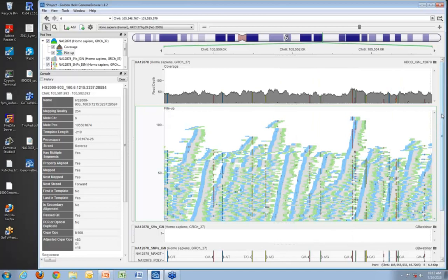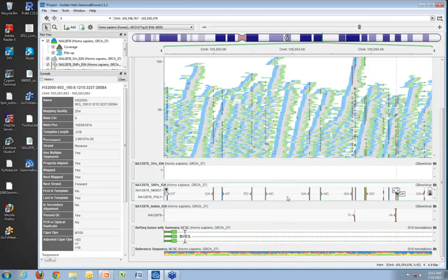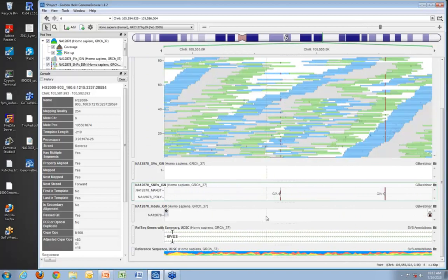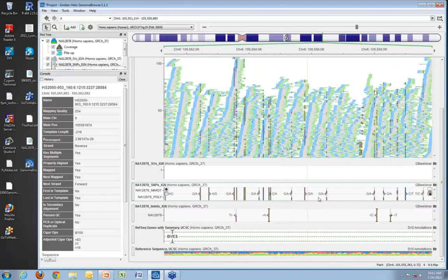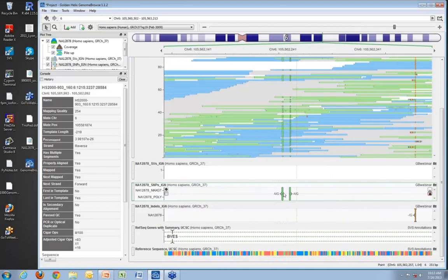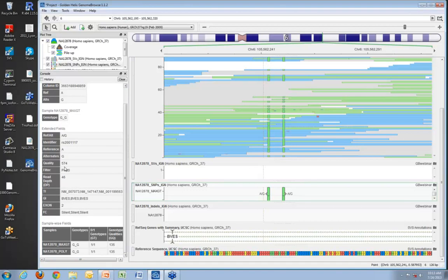Looking closer at the VCF file representation — this data comes from the Illumina Genome Network (IGN), which uses two different variant callers, so we see both sets of genotypes represented. We see both the MaxGT, generally a more conservative variant caller, and the Poly version. We can click on any individual feature and get all data contained in the VCF file for that marker set, quickly confirming quality scores or other filters.